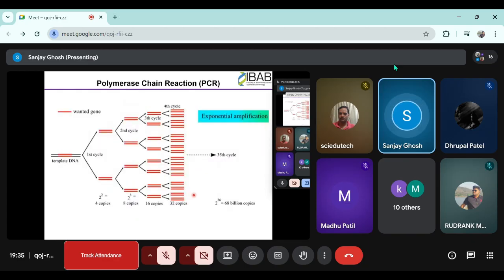Okay, so now I'll quickly go through some of the things of polymerase chain reaction, because most of these methods that we'll talk about are PCR based. So we have to be very clear what is PCR and how it is done and how the primers are designed, because those primer design rules are required for assembling DNA without the restriction enzyme that we are interested in discussing. So PCR, I mean, you all know how the nuclear fission chain reaction works.